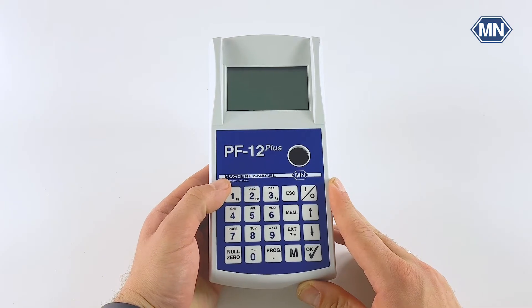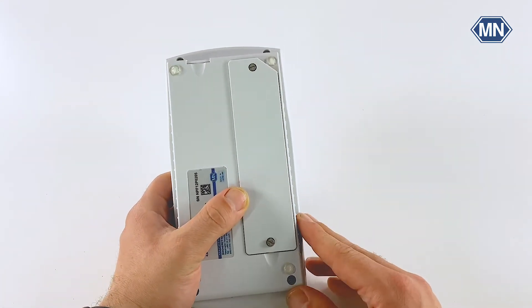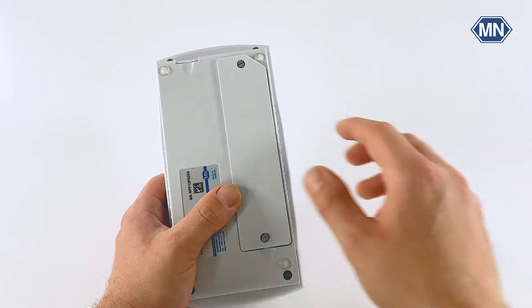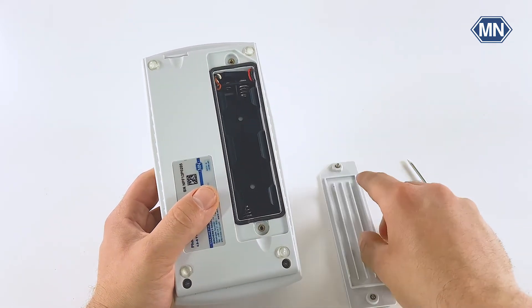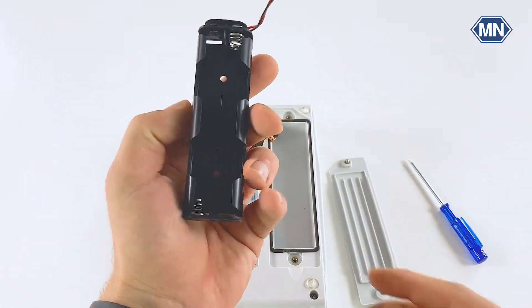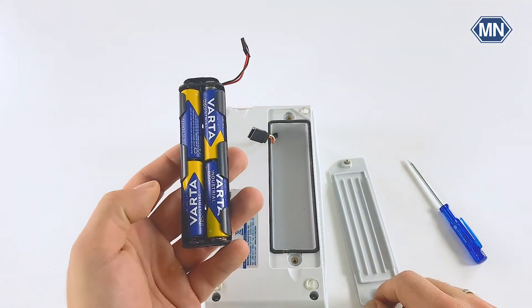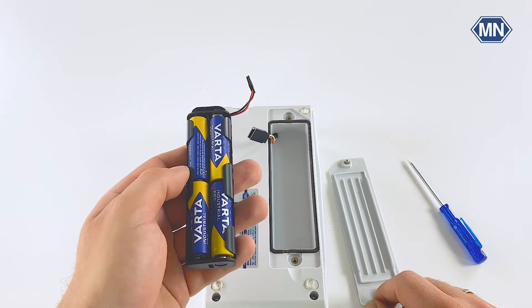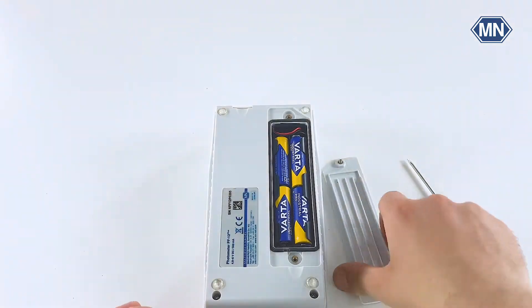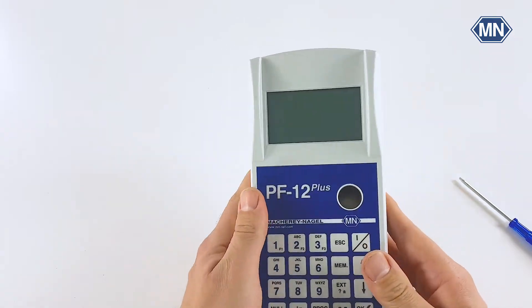Before we first start the photometer we have to insert the batteries. For this we turn the photometer on the back and open the battery compartment with the screwdriver which is also part of the delivery. Once the battery compartment is open we remove the battery holder and insert the included batteries. Once all four batteries are installed into the holder we can reassemble the instrument in reverse order. When we have closed the battery compartment completely we are ready to start.